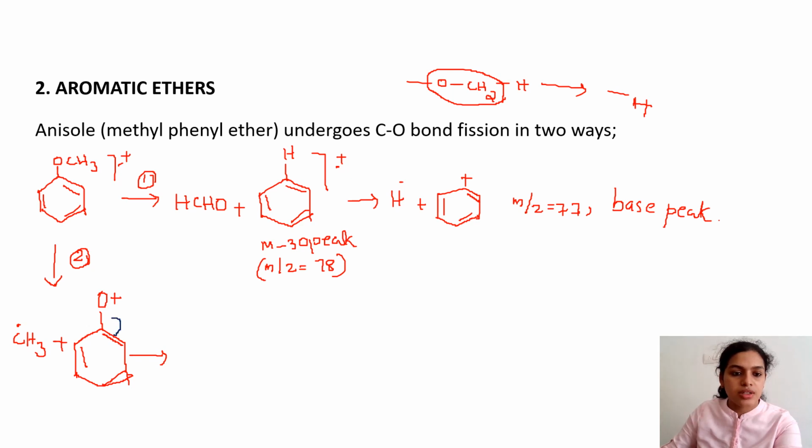See, this double bond is shifting in between this CO bond, and therefore this CC bond is shifted to this carbon atom. Therefore, whatever you will be getting is a species like this. From a 6-membered ring it has reduced to a 5-membered ring, and this carbon contains a CO group now. Now it's clear, because this bond is shifted to this side and there is a CO group.